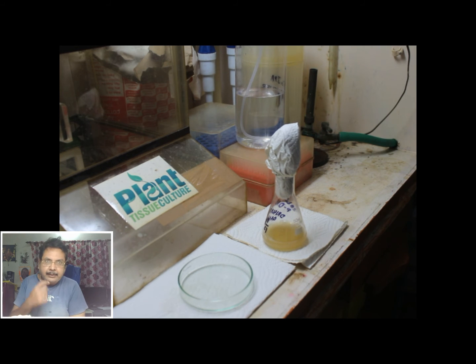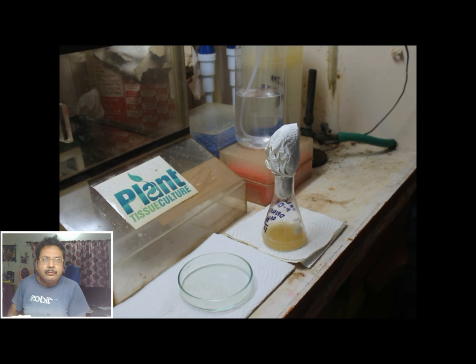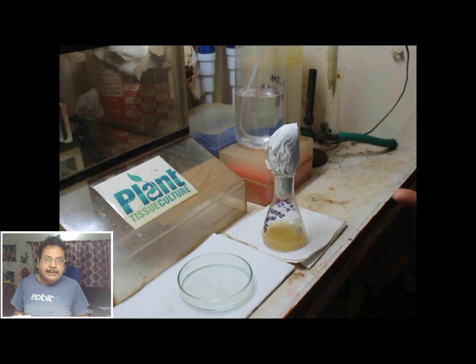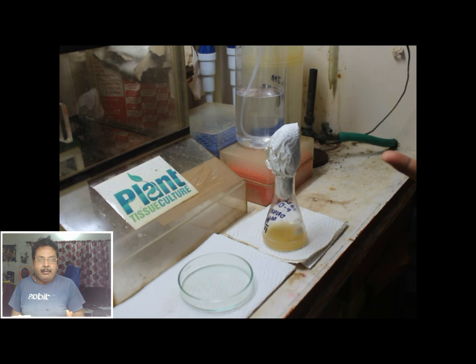So that we will be examining in a microscope, under the TTCM 400 microscope. So we will be seeing what happens. Now we will put 6 ml in the petri dish as usual, and we will see in the TTCM 400 microscope what is there. After that we will decide whether we will drink this water or just throw it away. That is up to you. You decide. It is nothing to me. You decide after seeing this video whether you will drink the water or what you will do. I am just presenting the video. It is my work to present the video. It is up to you to decide what you do.